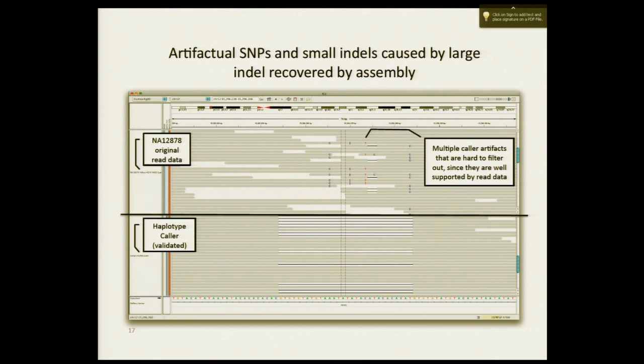Sorry, I just don't quite understand how you've gone from there to that. Are you saying that all those large blank parts are shifting over? Yeah. So basically, what you see is that it's sort of a tandem repeating thing, right? You've got these alternate ACs, ACs, ACs, and then it switches to GTs, GTs, GTs.